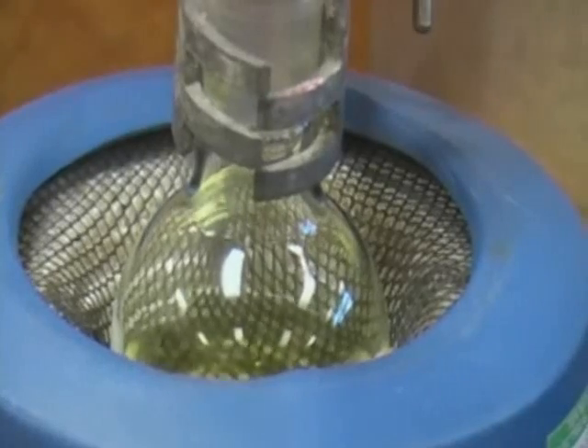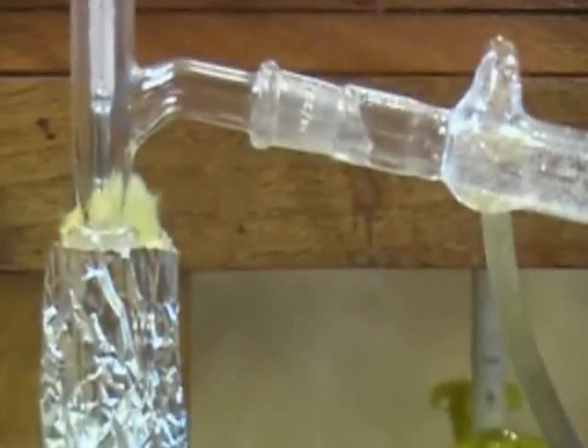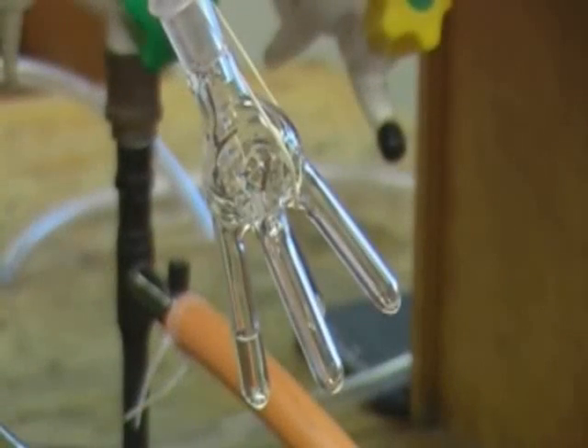As the contents of the distilling flask begin to boil, it's important to watch the thermometer. The temperature will rise before reaching the boiling point of the first fraction. This will be evident when the temperature stops rising, at which point you should collect the first fraction. Here you can see the fraction condensing around the bulb of the thermometer before being collected via the pig.